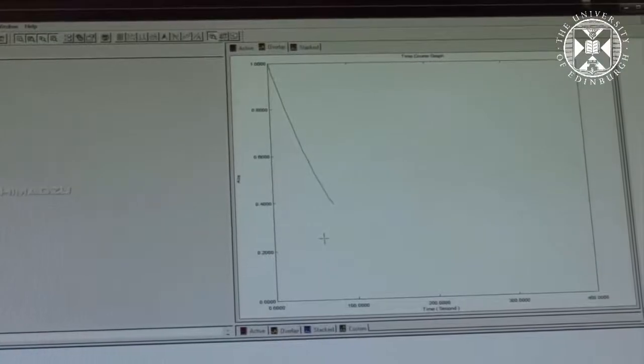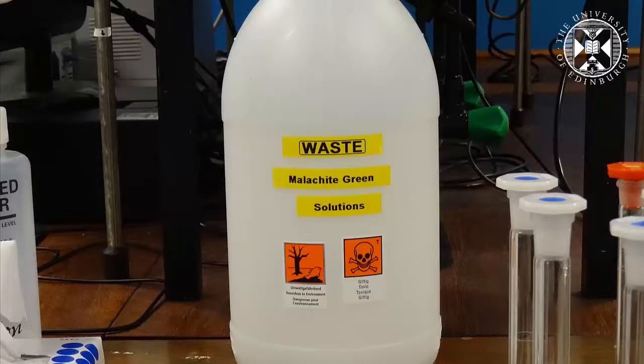Extract your data for analysis before finishing up. Dispose of any waste malachite green in the waste canister provided. It is toxic to aquatic life.